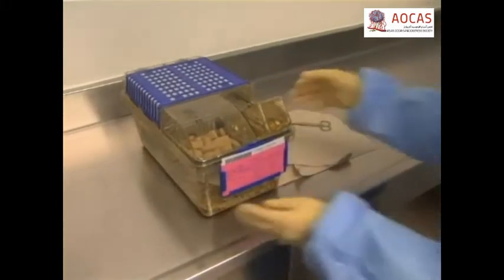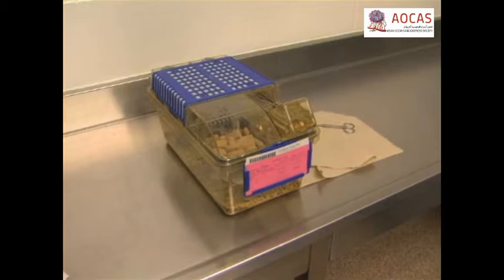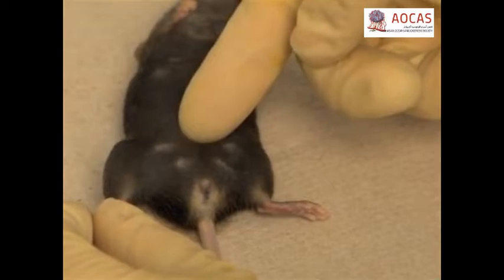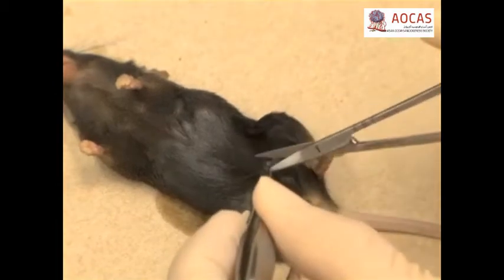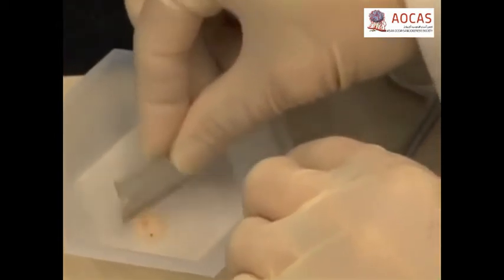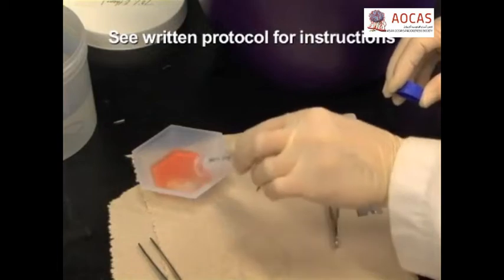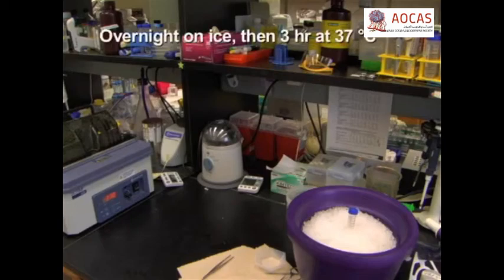To isolate donor mammary cells and fibroblasts, sacrifice age-matched 10-week-old female normal or PYVMT transgenic mice whose tumors are evident and palpable using approved IACUC methods. Make an upside-down T incision between the nipples of the thoracic and inguinal mammary glands and pull the skin flat back to expose the mammary glands. Remove the mammary tissues and mince into small pieces using a razor blade or surgical scissors. Prepare 100 milliliters of an enzymatic digestion cocktail — refer to the written protocol for detailed instructions — then incubate the tissue in the cocktail overnight on ice and then for 3 hours at 37 degrees Celsius.